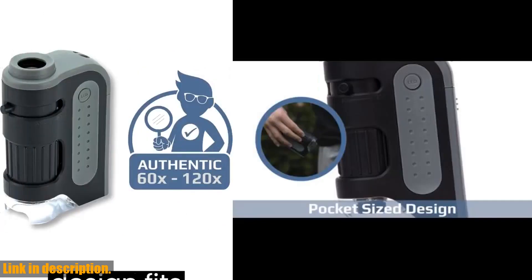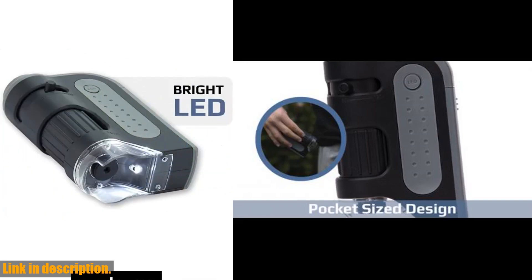What's more, this pocket microscope is designed and lab-tested in New York by Carson, USA optics experts since 1990, so you can trust in its quality and reliability.